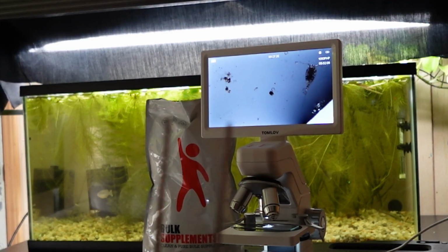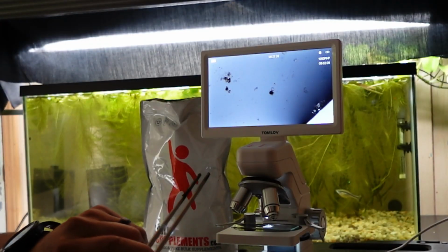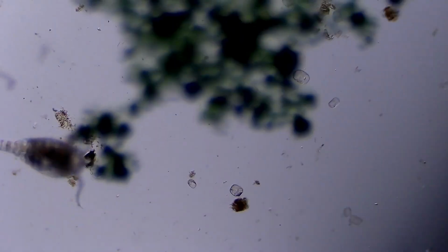I put a drop of aquarium water underneath the microscope, and what we're about to look at may surprise you. All right, I'm about to put the tiniest bit of spirulina powder inside this little droplet here. So let's see if we can make that happen, and then let's see what it does.